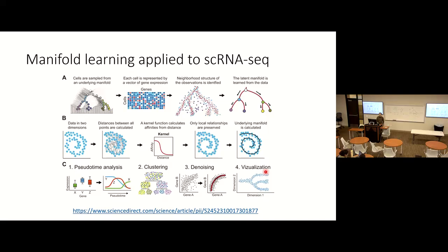Okay, so this is t-SNE, and we are moving to the last dimensionality reduction technique. It's called manifold learning, and it uses PHATE. So the idea is all the cells have a relationship, and you can build a cell-to-cell network.